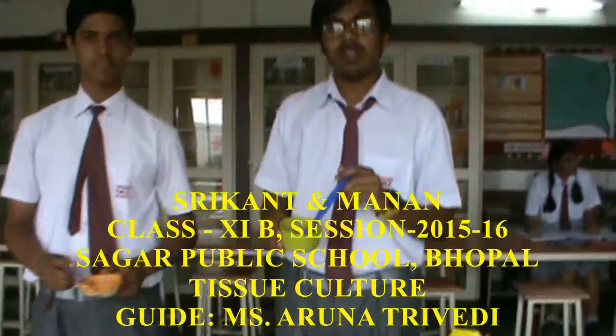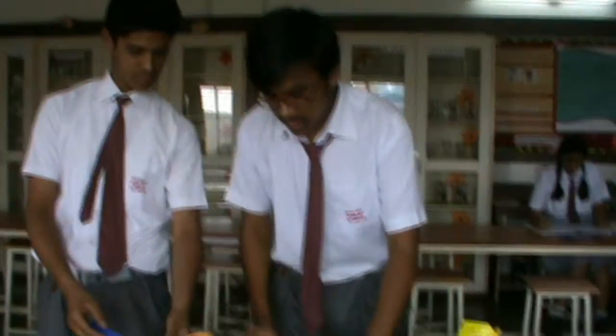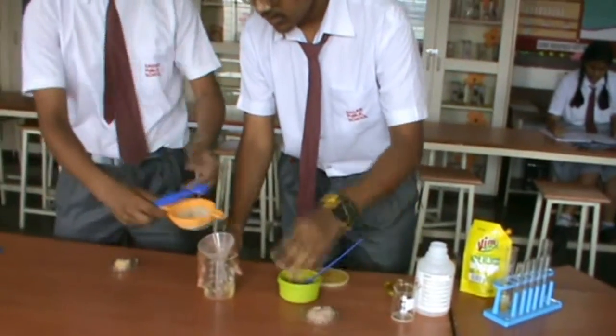First we will take the paste of onion which we have made with warm water and salt, and then we will take it in a test tube, in a beaker.